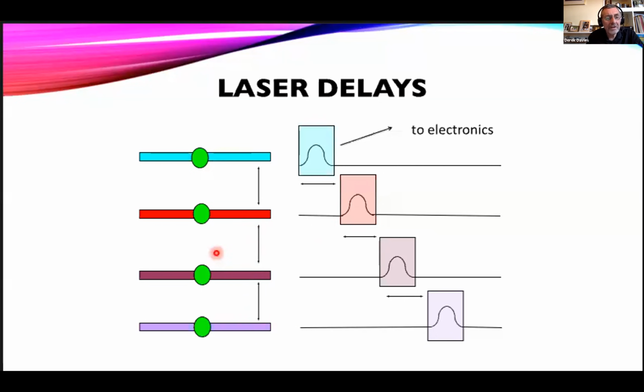Now, in a fixed system, this physical distance is set. But it's not just that physical distance, it's how long a cell may take to pass through that. And that may vary with slight changes of pressure in my system. So again, it's something that we want to check during our QC process. So that's three things we want to check, isn't it? Alignment, sensitivity, and laser delay. Several beads that are going to do that.